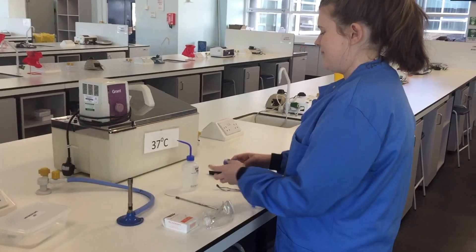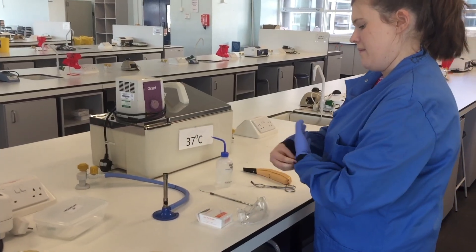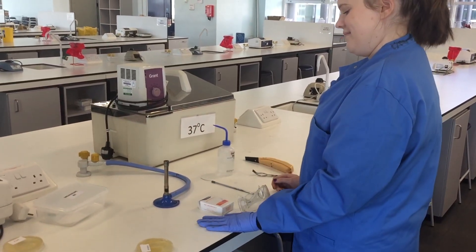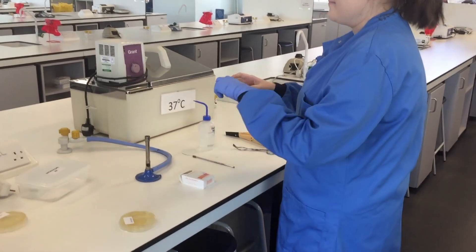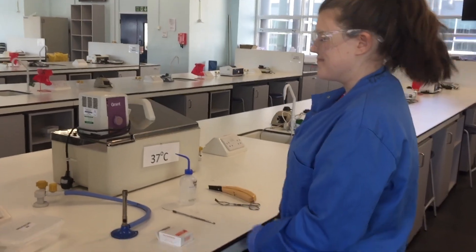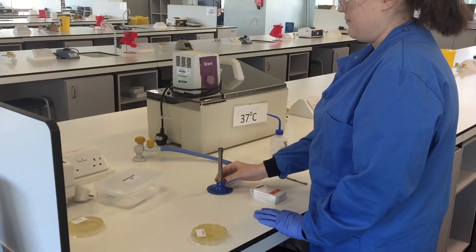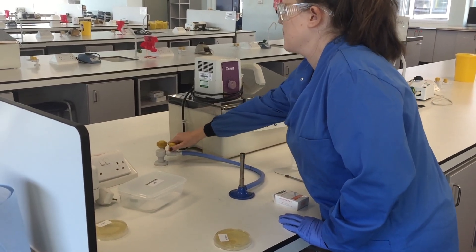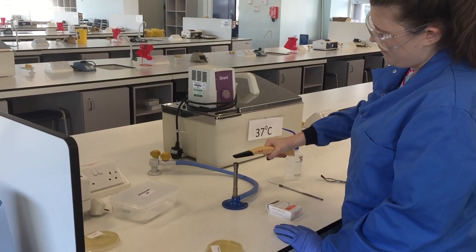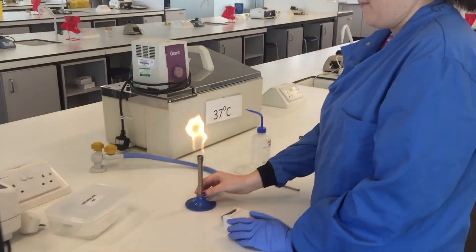Our demonstrator is going to prepare to do the gram stain. She's going to be handling her cultures, so she would like to wear a glove to protect herself from her cultures. She also needs to protect her eyes from any spattering or stains that she may come into contact with. Now she will light her Bunsen burner and put it to a blue flame.